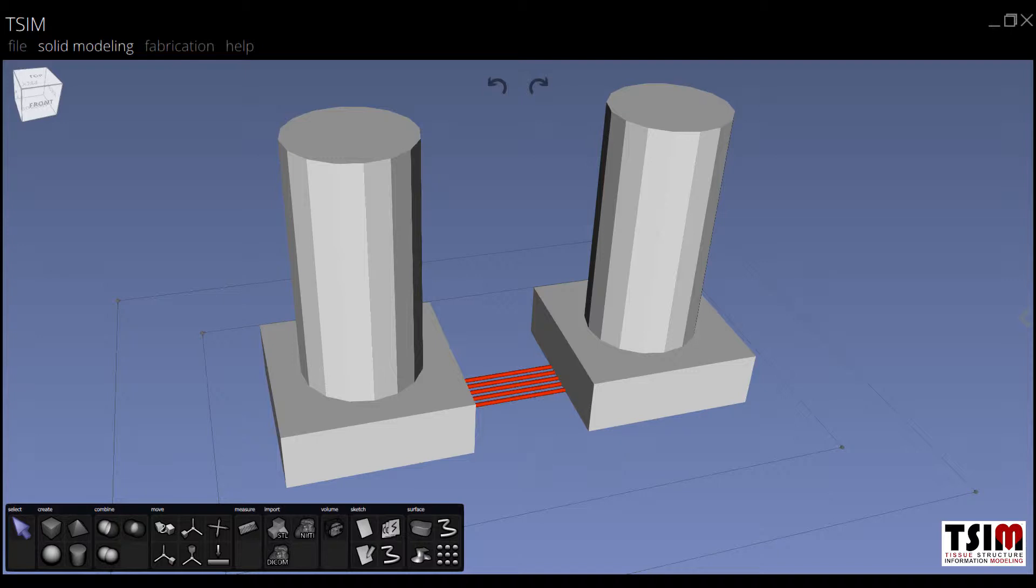Shown here in TSIM, a mock-up of that particular device. On the left is a tall inflow tower connecting to an inflow reservoir. On the right is an outflow tower leading out from an outflow reservoir.